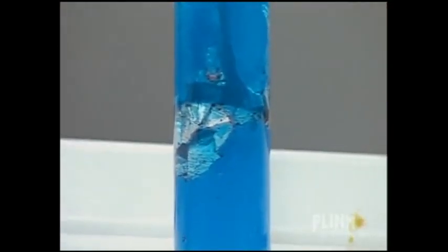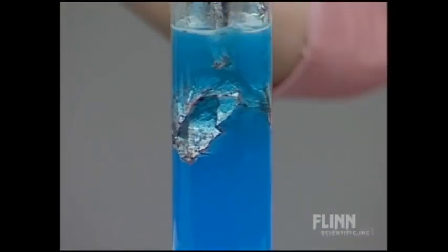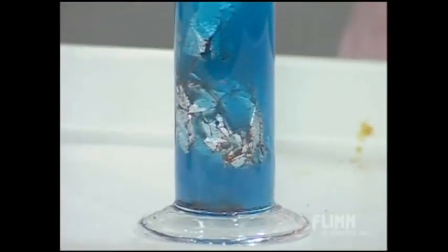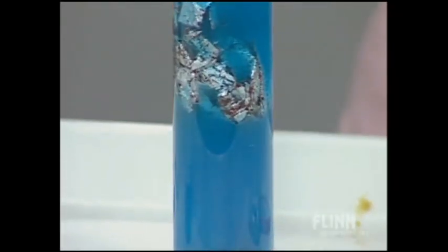Do you see? Now we see some metal being produced. We're getting a little bit of bubbles. We can tell that because it's actually floating to the surface. Actually, kind of when it does it slower, it's almost nicer because it's slow motion by itself. Clearly, the reaction is now taking place, not as fast as the other. That might have to do with mixing and so on.